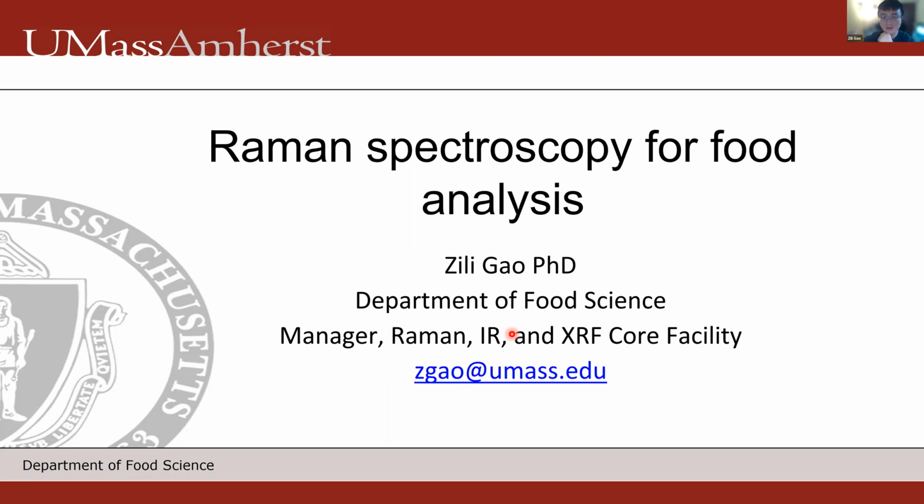So in today's seminar, it will be two parts. The first part is I will introduce some of our lab research, mainly for the food analysis of Raman spectroscopy. And after that, I will introduce to you some of our other instruments and services we could provide to you and for potential collaboration.